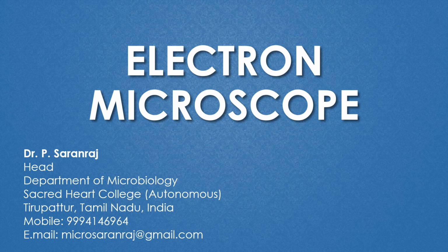Dear viewers, greetings. In this video, we are going to see about the electron microscope and its types, the transmission electron microscope and the scanning electron microscope.